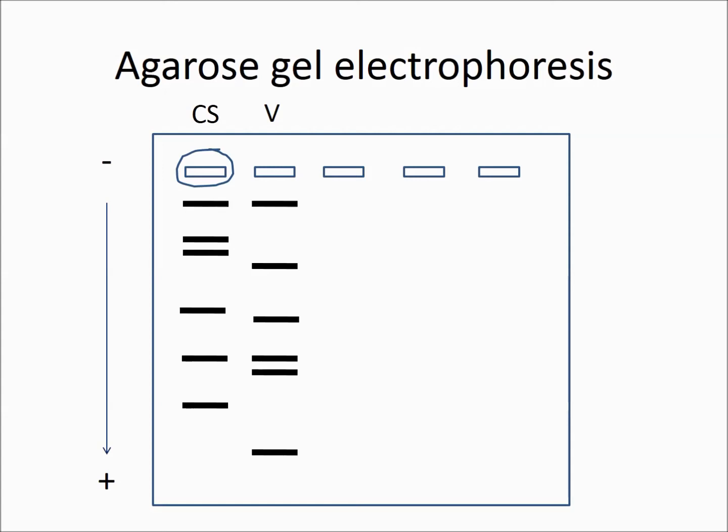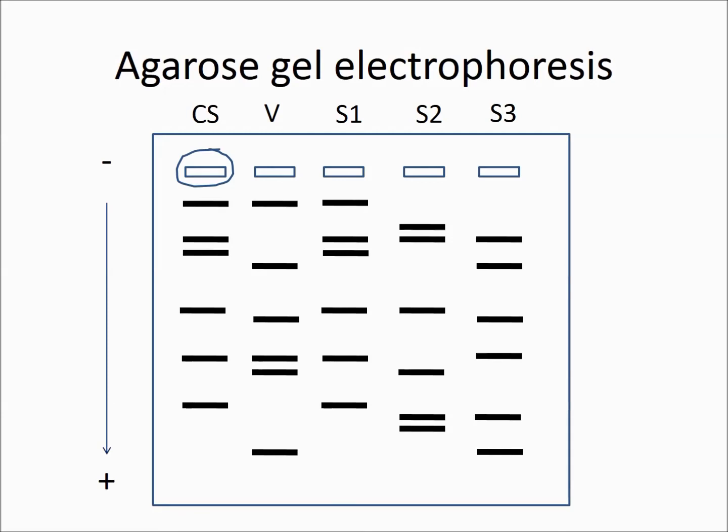Let's say you have three suspects and you wish to amplify their DNA and separate the target sequences by agarose gel electrophoresis, and these would be the patterns of bands obtained. So there's suspect 1, suspect 2, and suspect 3. So 3 different fingerprints. Based on the fingerprints, the patterns of bands, you would say confidently that suspect number 1 is the perpetrator of this crime.